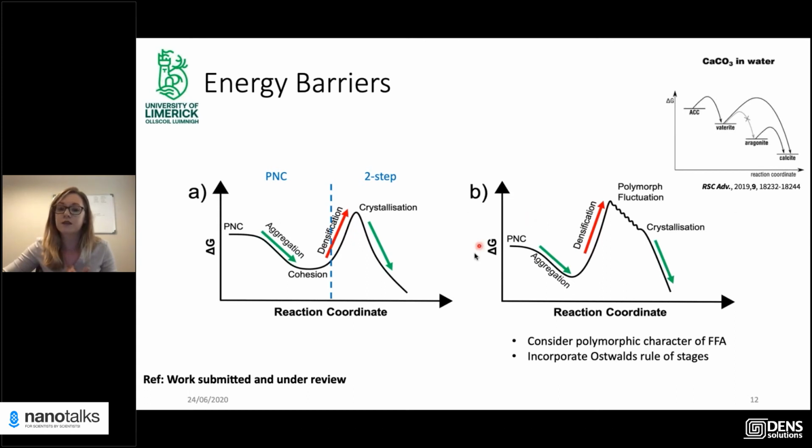It sometimes isn't as simple as just applying a crystallization theory to what we see, but it could actually be an insinuation that the pharmaceutical materials may undergo a quite unique crystallization, which can give us more information on the manufacturing process of the materials.